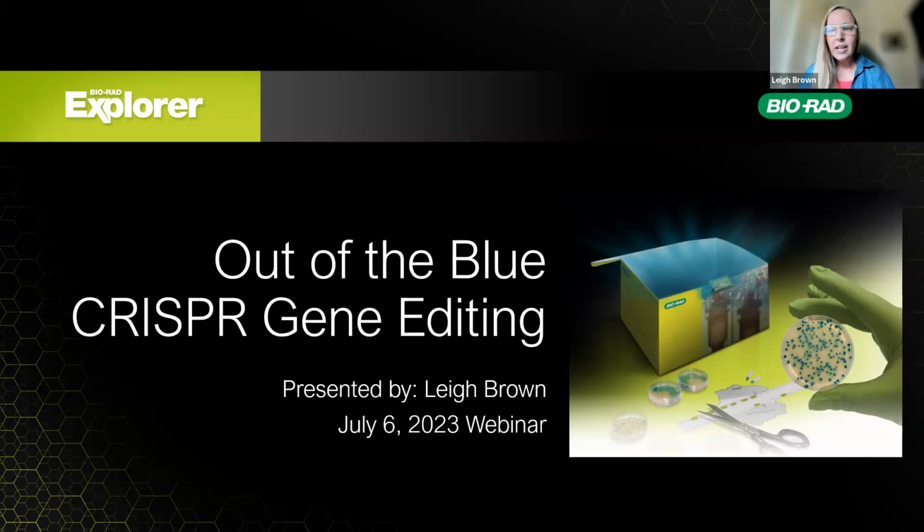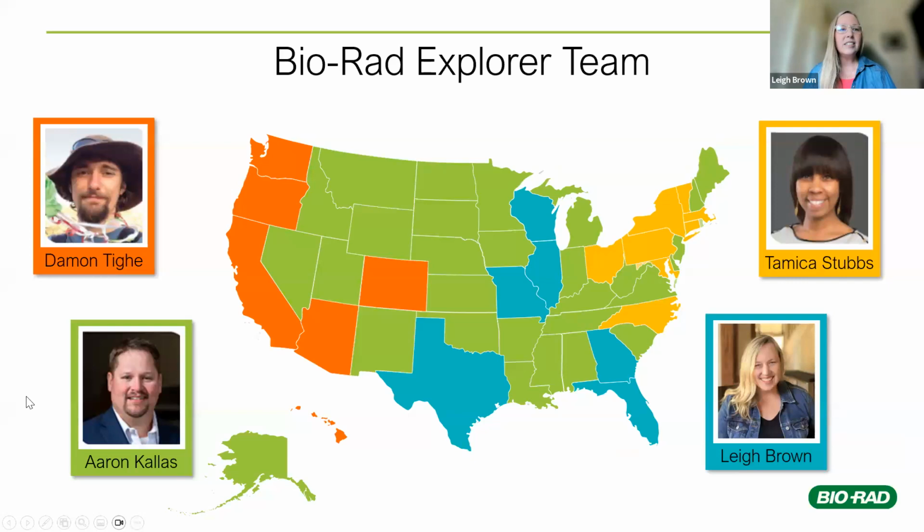We're really going to talk about how you can teach CRISPR in your classroom. We'll spend a little bit of time on the lab itself, but probably save the bulk of that to a webinar that we're going to have in August, where we'll be doing the hands-on lab. What I really am hoping to do during this one is get you acclimated to how you might present this in your class, and where there's some good resources, some free resources especially, that you can do with your students as well.